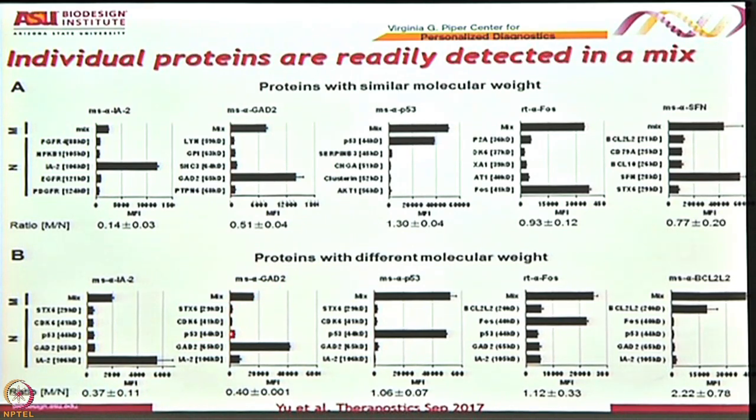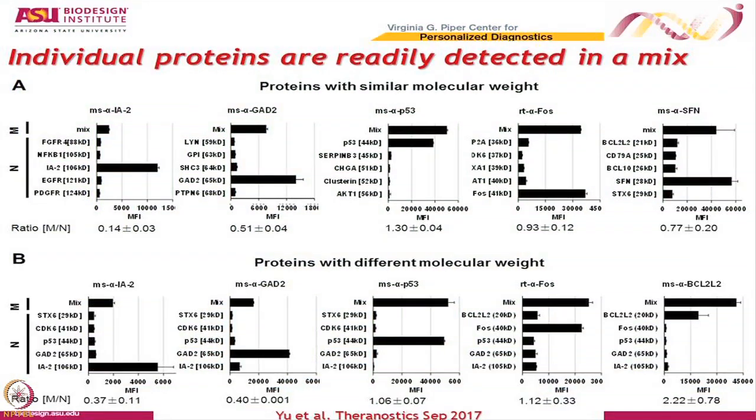Same is true here. This one is 65 kilodaltons, a much bigger protein than some of the smaller proteins. And so in every case, we're able to detect the protein either in the mix or by itself. That gave us a lot of confidence. And these are just some of the data. He did much more of it.